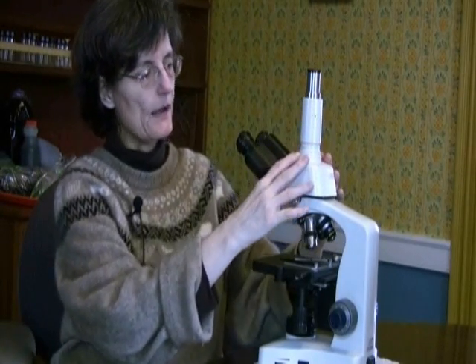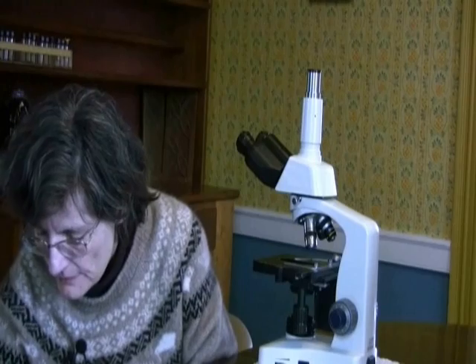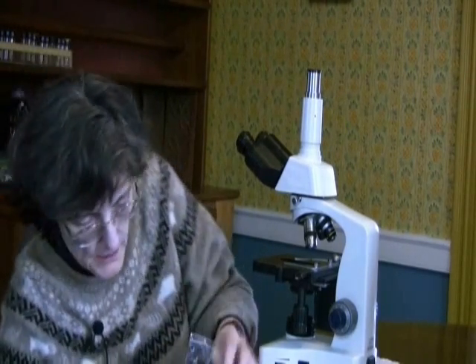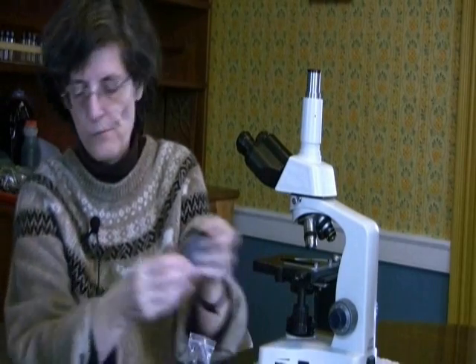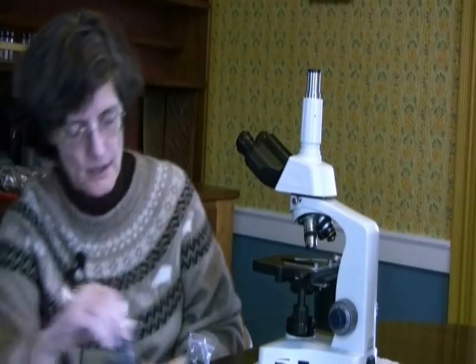So we've got our trinoc on. We want to put our eyepieces in. So go looking through your microscope case. In this particular instance, we've got these eyepieces. Store things away where you can find them again. We also have these eyepieces.